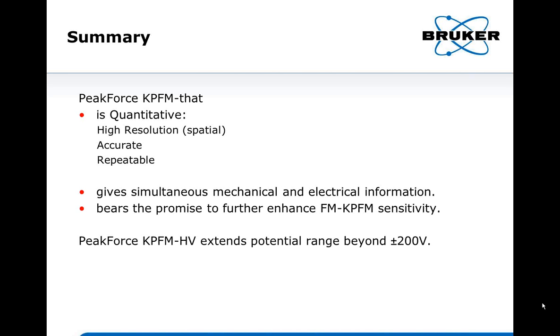On the carbon nanotube KPFM data, would there be a variation of height when the carbon nanotube increases in diameter? Would that affect the KPFM data? So to have high resolution, you really want the tip to stay close. In the probe modeling, I mentioned that of course there's a dramatic difference between frequency modulation and amplitude modulation KPFM, and also there's a dependence on the lift height. So you want to stay close for those small features.